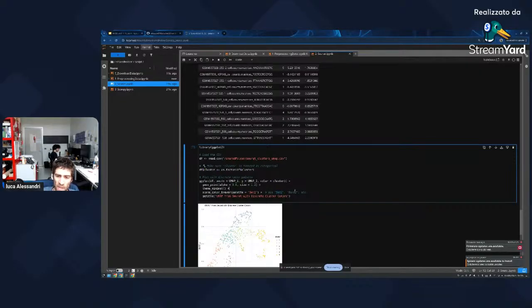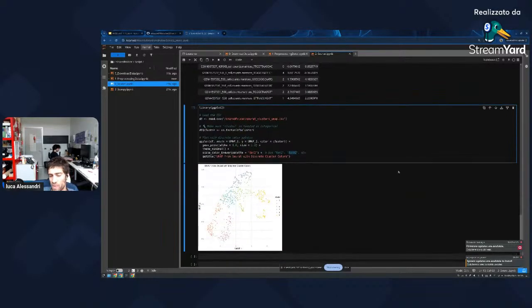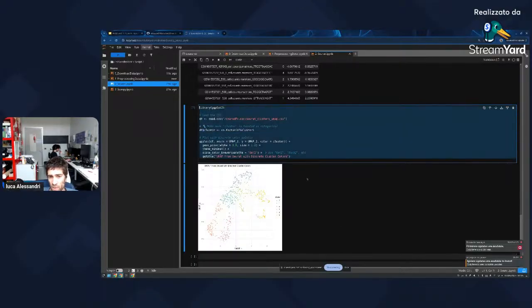You can use the set 1, a dark 2, and so on, or specify every color for each of them. So that's totally up to you. But you need to extract this one if you want to get creative. This is Seurat. So very great tool, super updated every time. And of course, if someone asks me, I also use Seurat most of the time.